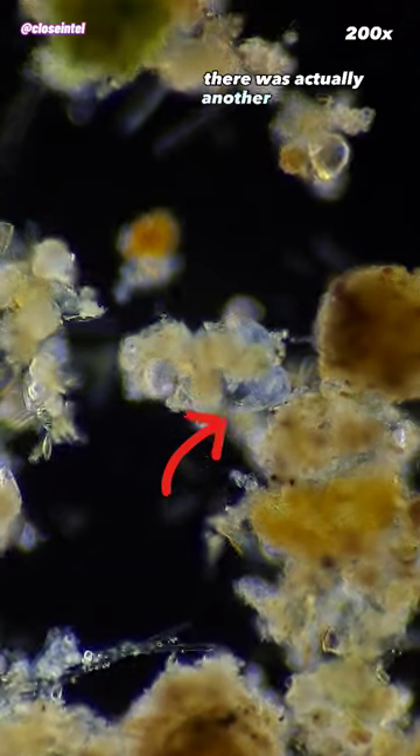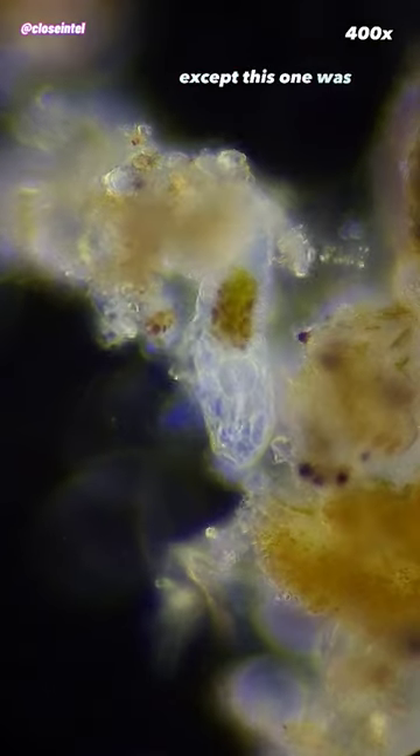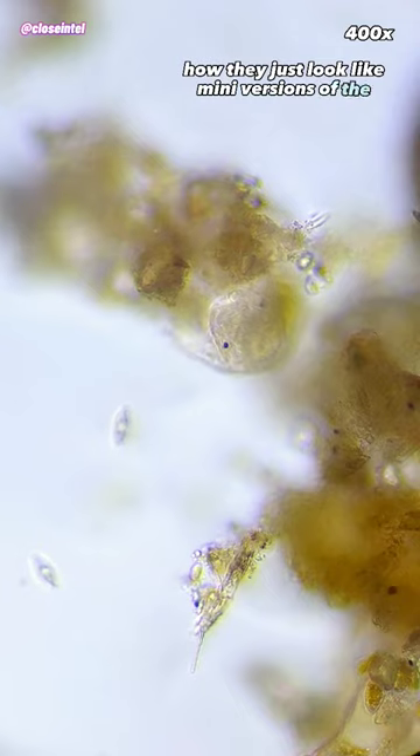And to my surprise, there was actually another water bear hanging out in a pile of diatoms on the same slide, except this one was still just a baby. I've never seen a baby tardigrade before, and I thought it was interesting how they just look like tiny versions of the adults.